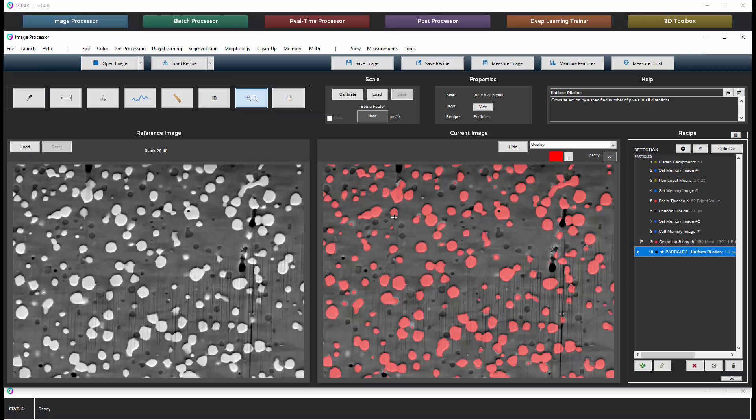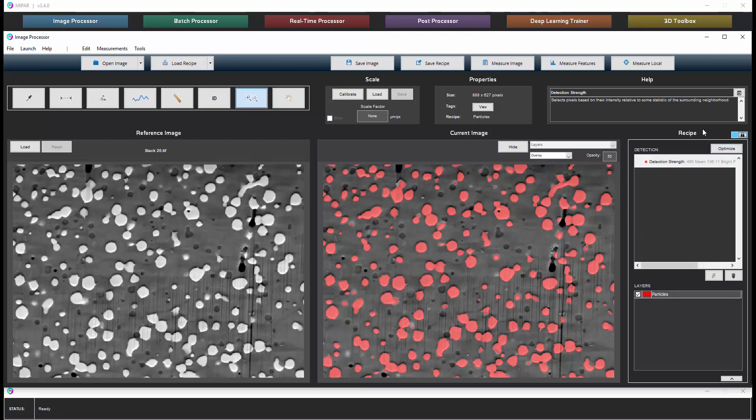We'll complete the particle separation in three dimensions after we have applied this recipe to all slices. We also would like to add a calibration factor. A calibration factor in X, Y, and Z is required to make a 3D reconstruction.